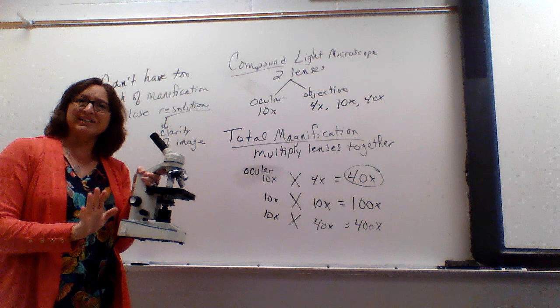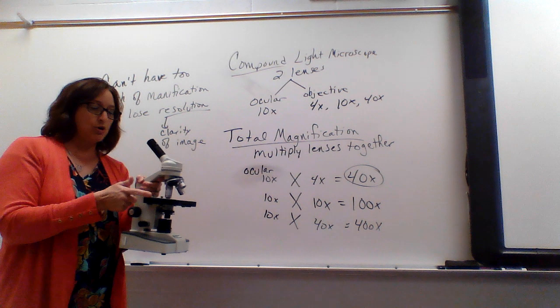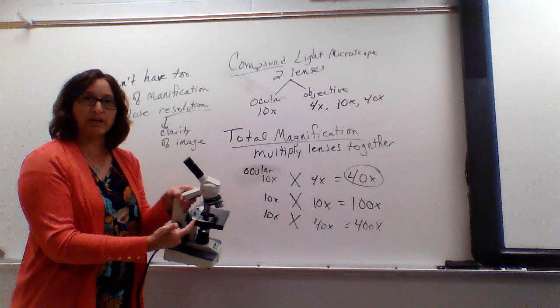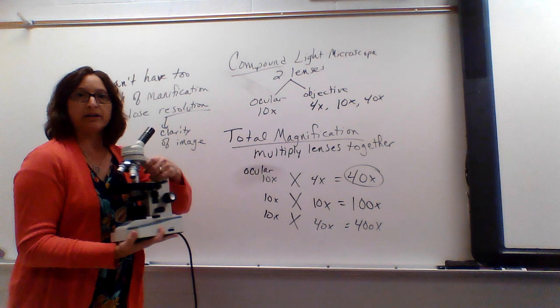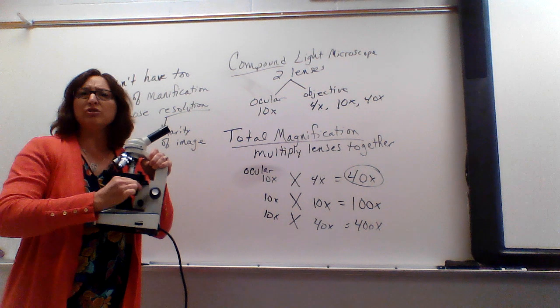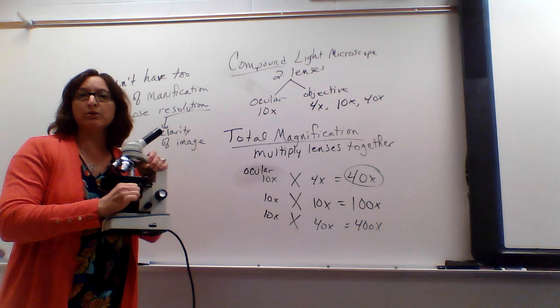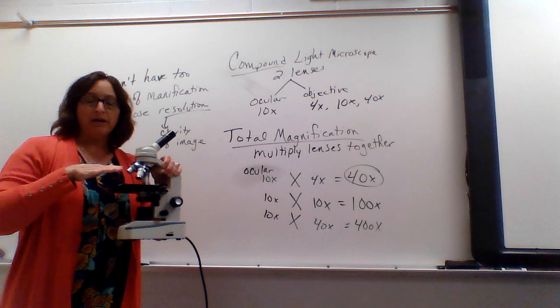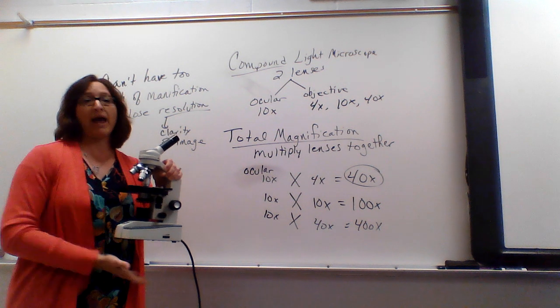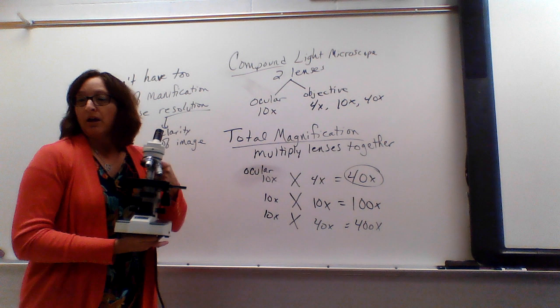In the last video, I did forget to tell you how you move your slide left and right and up and down. You don't push on the stage clip right here. They've got knobs right along this side, and you'll use these when you come into class. It'll be easy to see. When you move these back and forth, it'll move the stage back and forth, left to right, front to back. So that's how you're going to move your slide.